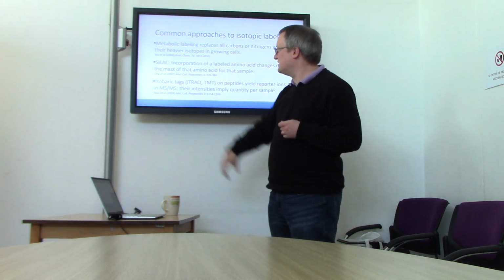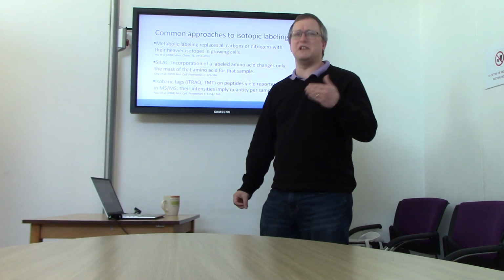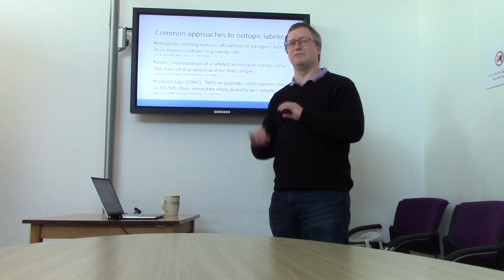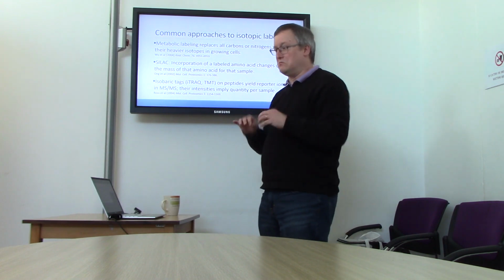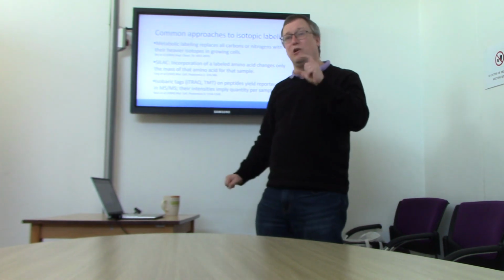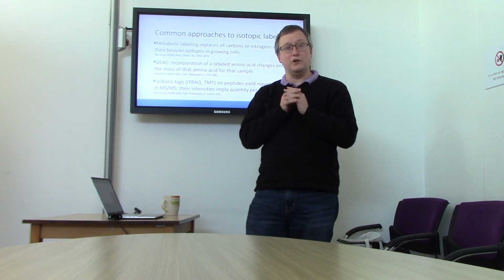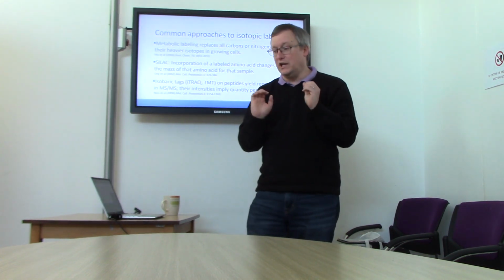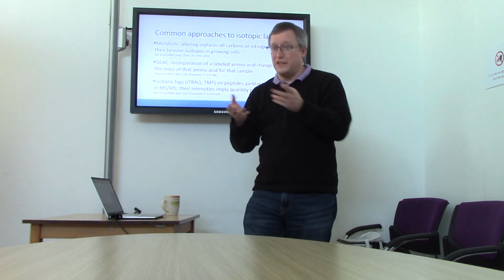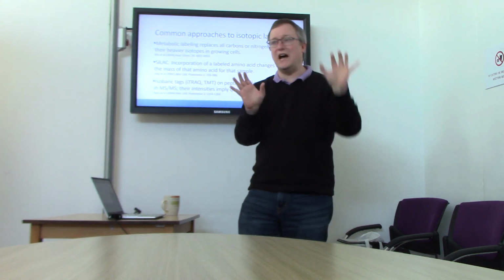So SILAC is an approach that was put forward in large part by, really popularized by the Matthias Mann lab, but it's been used by others as well, which is the suggestion that we're not going to replace all the nitrogens in this organism, or all the carbons in this organism. We're going to instead replace all of an amino acid with a heavy variant. So if you are able to label a sample in which every lysine and every arginine is heavy, that's one way that you can force one sample to be at a higher mass than the other.